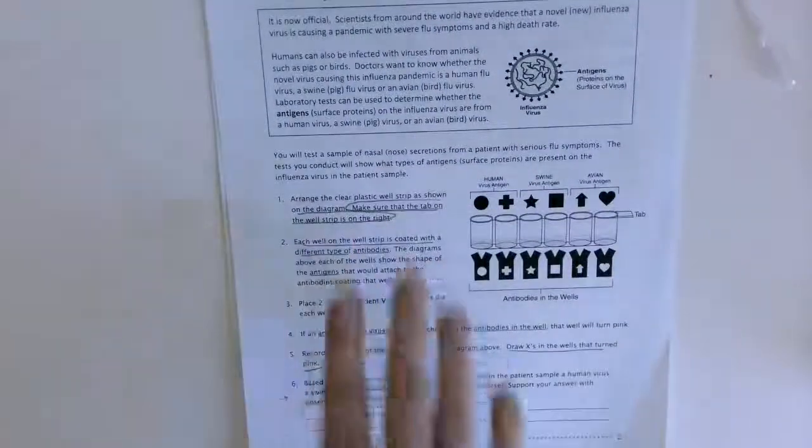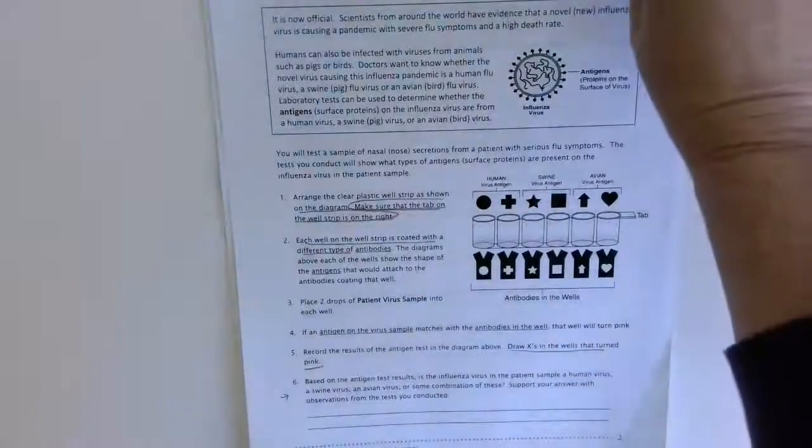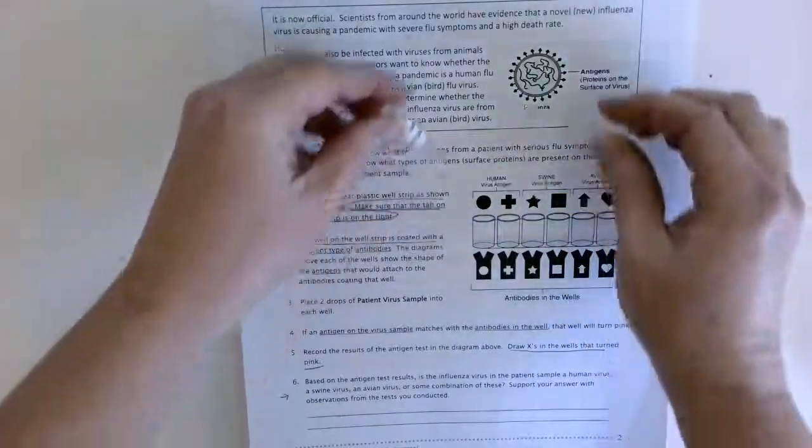So this first part is very background. Going on to the second part, part 2, again, don't miss this reading at the top. Make sure you do it. And then you're going to actually do some of the chemical experimentation. So you have a vial here of a patient virus sample. You have a clean pipette. Make sure you keep that clean.